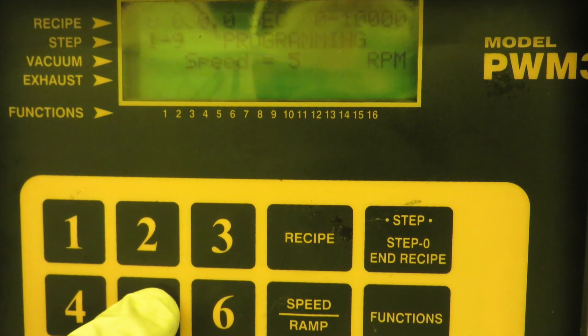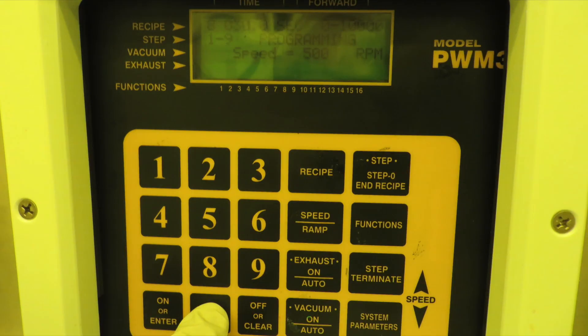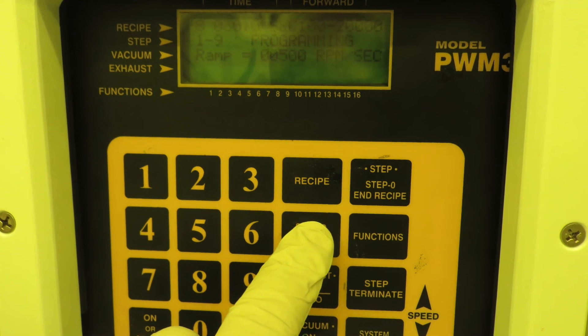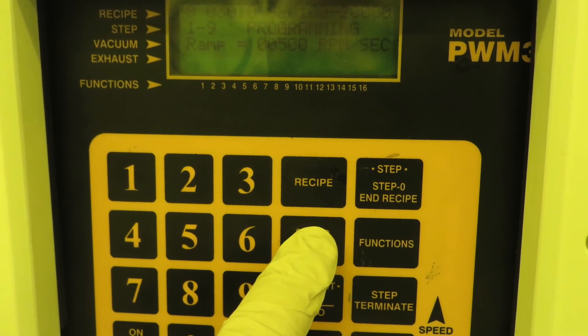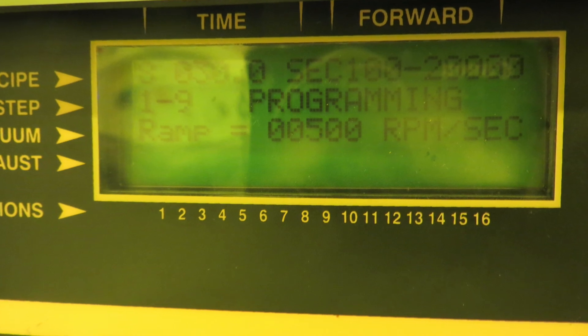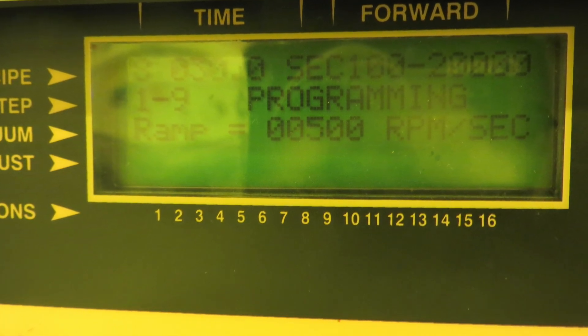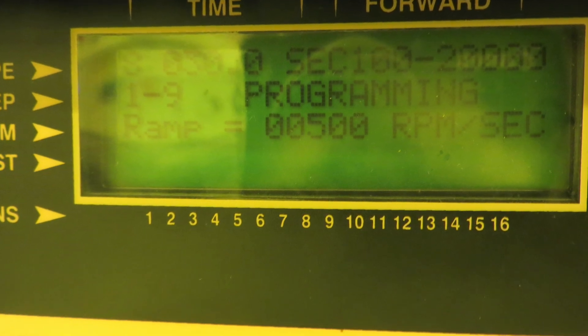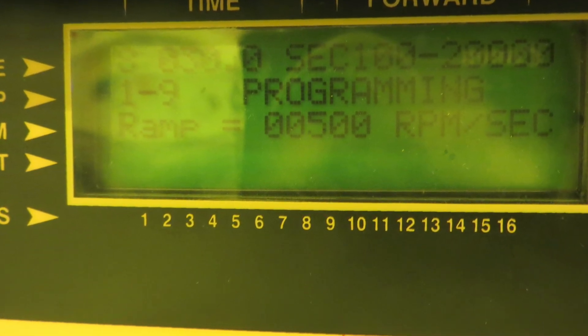So if you wanted to change this, you would put the numbers that you want, then hit enter. Otherwise, just move on to the next step, which is terminate. After you hit terminate, this is where you would enter how long in seconds that you want the spinner to hold steady at the RPM you just entered for step one. If you want to change this value, just punch in the new numbers and hit enter.